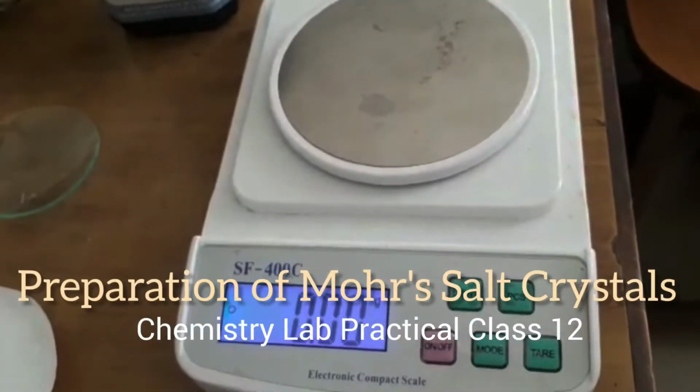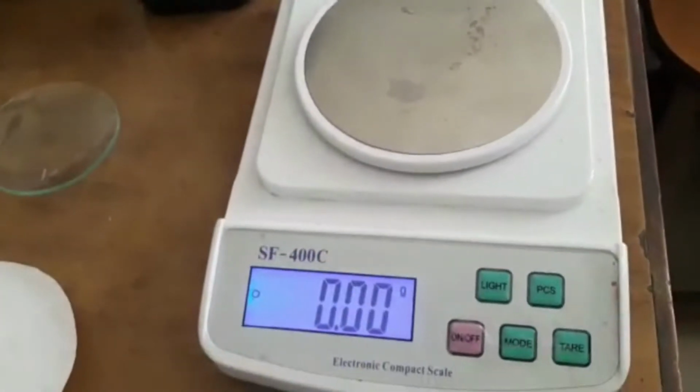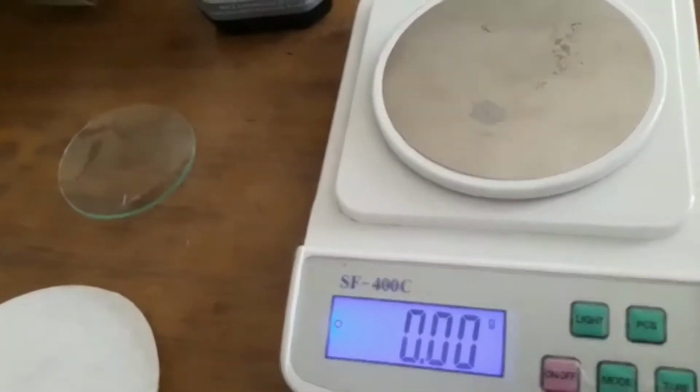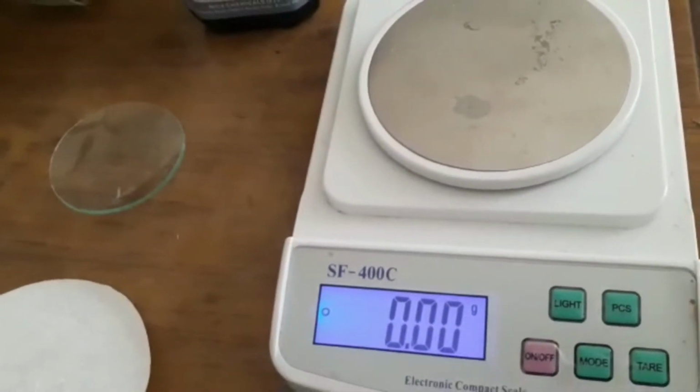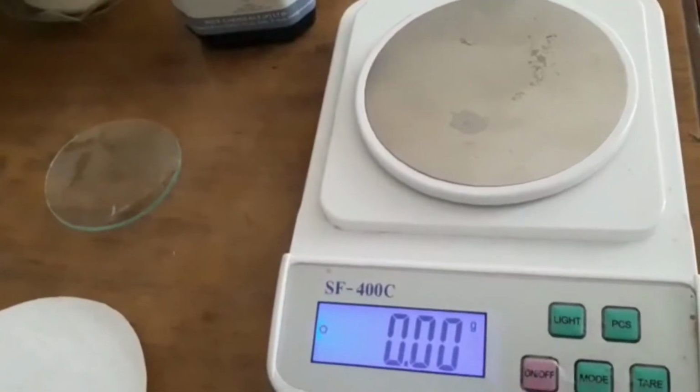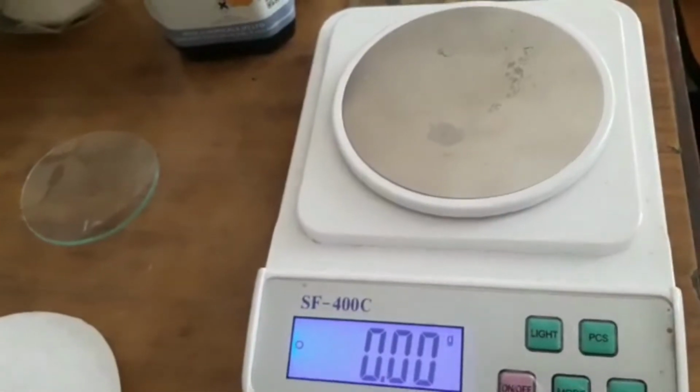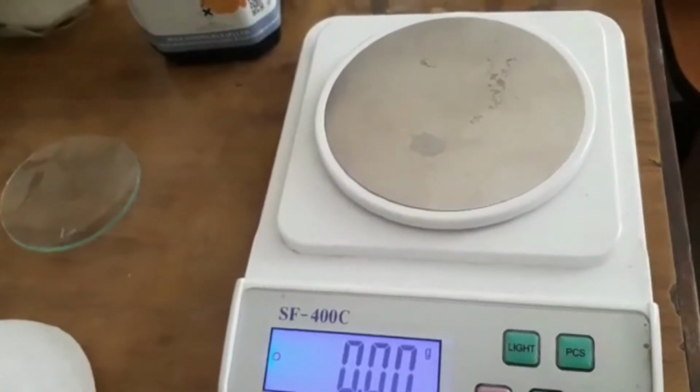We're going to prepare Mohr salt crystals, and for that we're going to take ferrous sulfate 12 gram, ammonium sulfate 6 gram and dilute sulfuric acid 2 to 3 ml. It's roughly less than half a test tube. So we start with weighing the components.